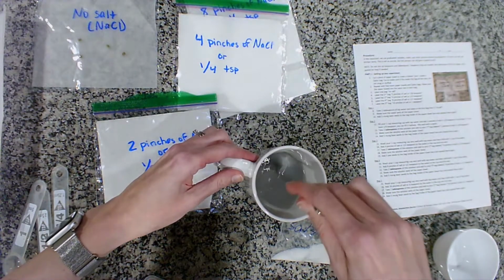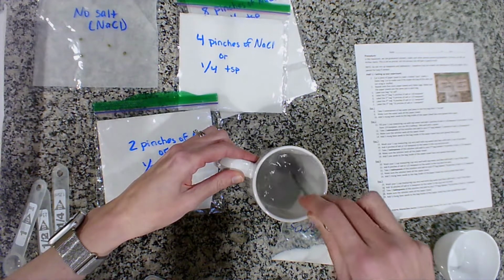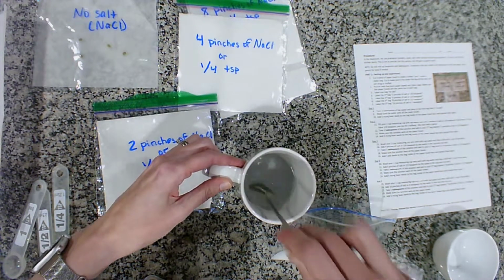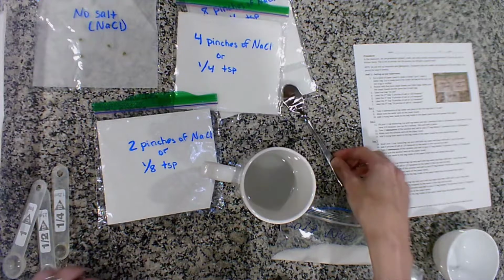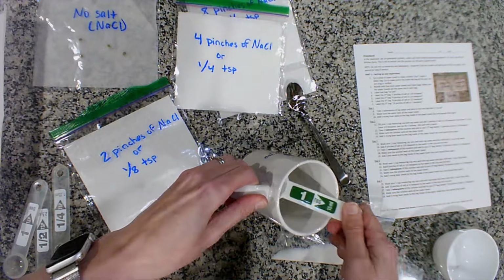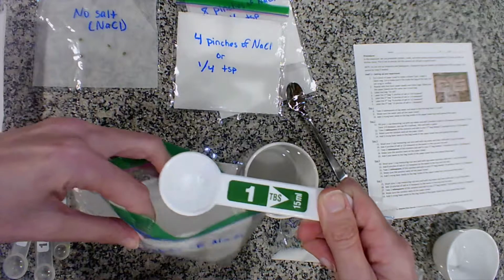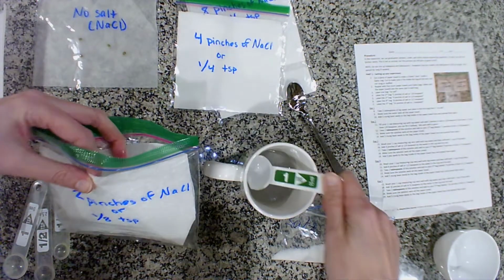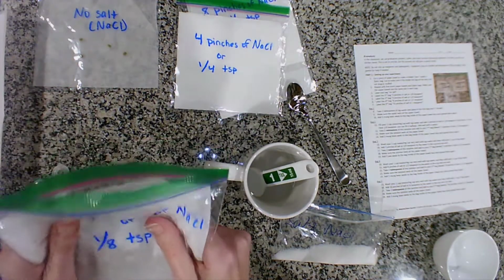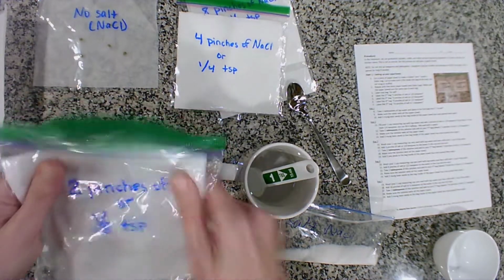Okay, so then I'm going to go ahead and stir. Give it a good stir. And then I'm going to go ahead and take 2 tablespoons of this salt solution, pour it into my 2 pinches of NaCl bag. Okay, make sure it all gets nice and wet.